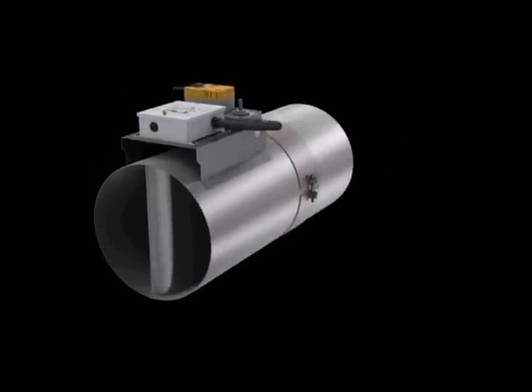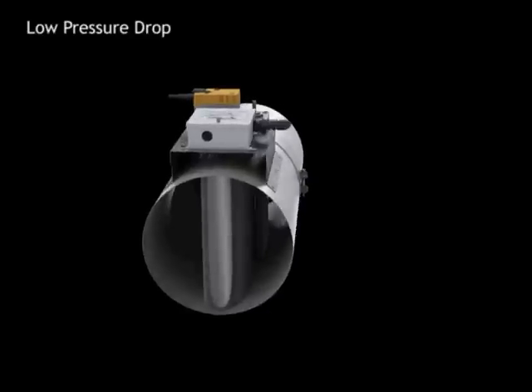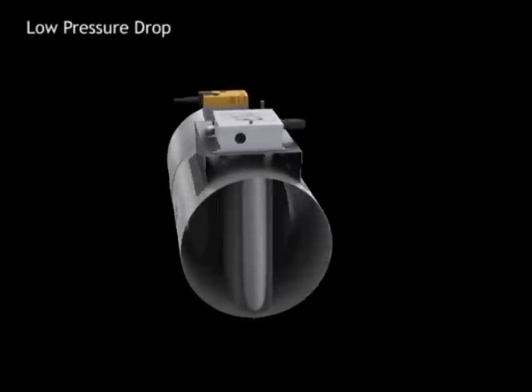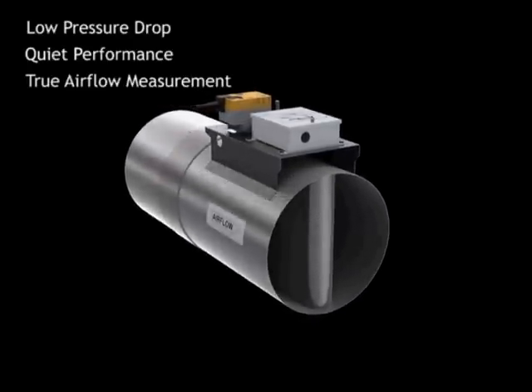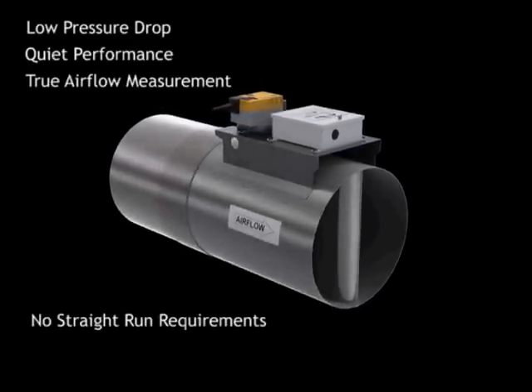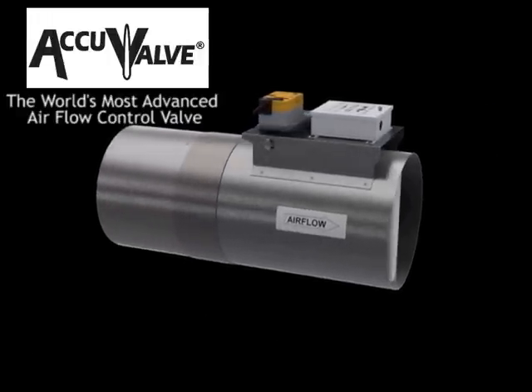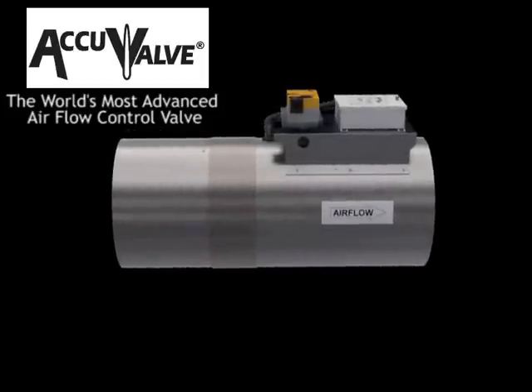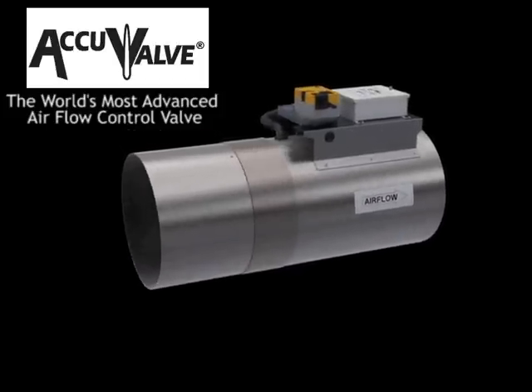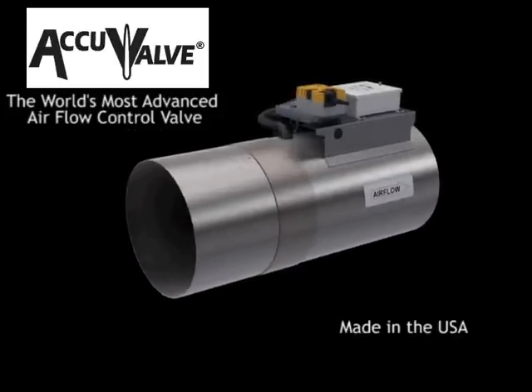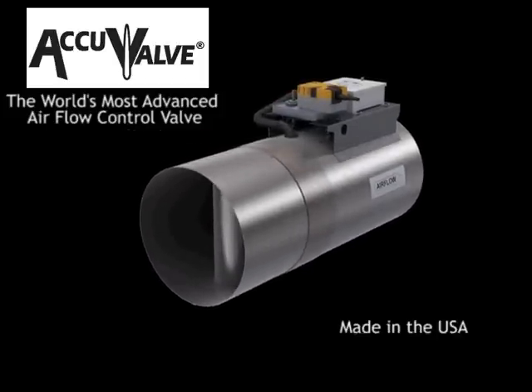Combining the inherent design benefits such as low pressure drop, quiet performance, true airflow feedback as well as many others, the AccuValve takes you into the 21st century with the highest degree of safety and accuracy of any airflow control valve available in the world.